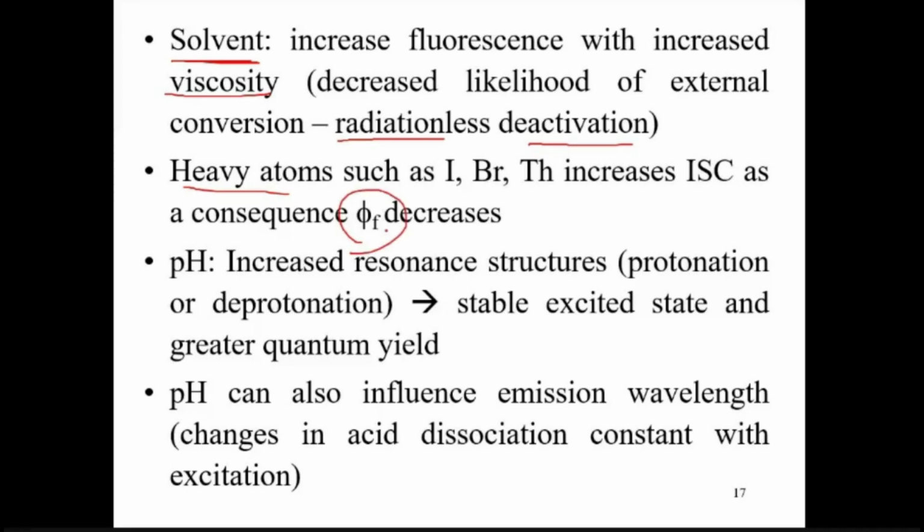decreases for fluorescence. Now, when molecules are big and they are forming molecular orbitals, the molecular orbitals are fairly complex and there are many of them. There will be the outermost orbitals and there will be intermediate internal orbitals.